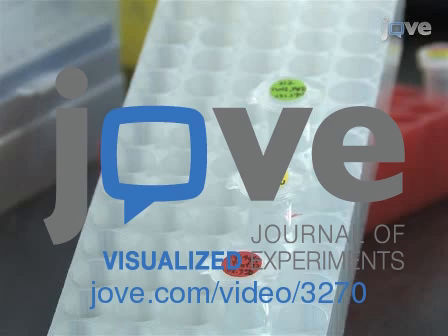Gently poke the worm and pump in the injection mixture. Notice the eggs separating towards the distal tip, indicative of a successful injection. Reposition the needle to inject the lower gonad and repeat the injection. Since this gonad is under the gut, the spreading of the eggs will not be seen, and therefore it's more difficult to gauge the success of the injection. However, post-injection, the worm should remain intact without protruding gonads.